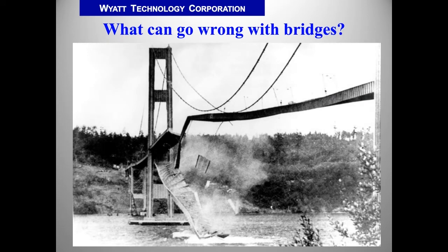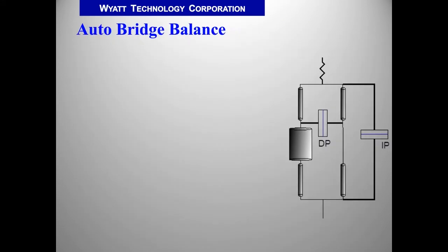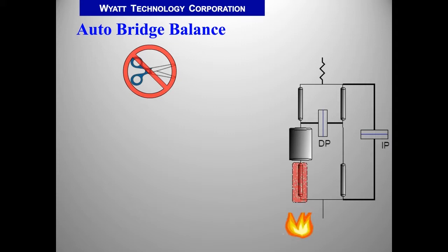Okay, so we found a solution for this as well, and this is another innovation in this device. It would be really nice if we could automatically balance the bridge without having to take it apart and cut and file and adjust capillary lengths. We want to do this without cutting and without opening and doing service. What we realized is that you can balance this without doing any modification to the flow design, as long as you can control the temperature of the capillaries.